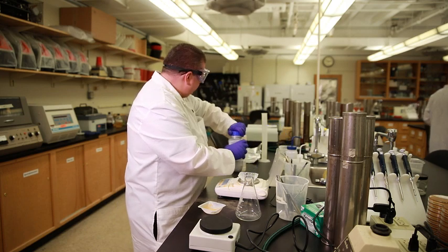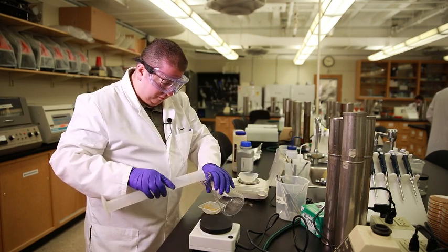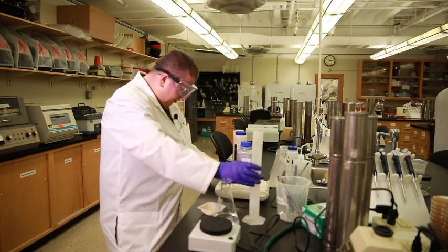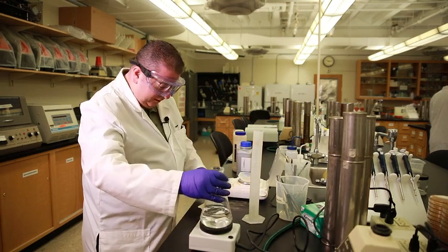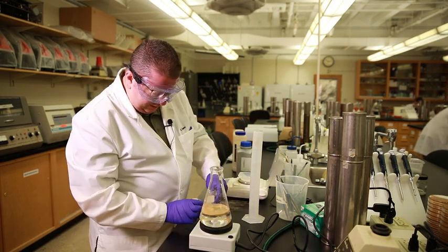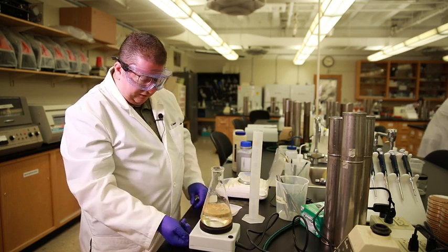All right, so in this cylinder I have 250 milliliters of water. I'm going to pour that in. And we need to get this nutrient broth powder to dissolve before we put it in the autoclave. So I've got a stir bar here. I'm going to drop that in. I'm going to add in my nutrient broth powder. Turn on the stir plate here. Let that stir. It doesn't need to stir for very long.